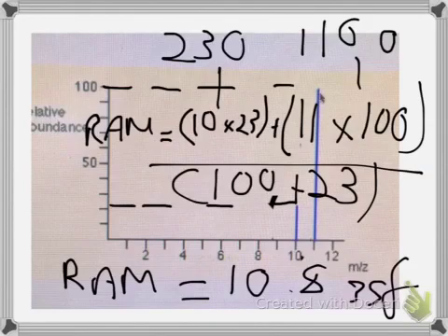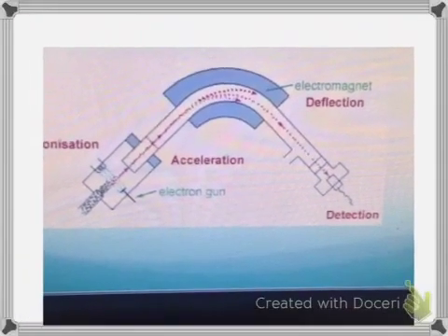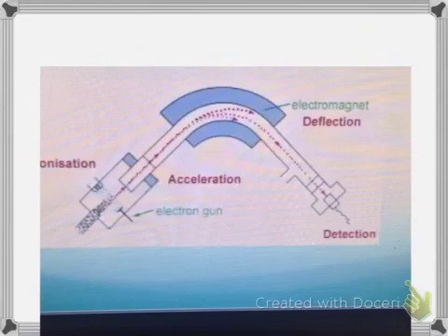And I could do that exactly the same for any molecule. Obviously, for diatomic molecules, I'm going to end up with a more complicated fragmentation pattern. Then we can look at my accelerator and my mass spec again, and see how this is going to be used to help in the detection of steroids in athletes, and how it's used by pharmaceutical companies in identifying drug precursors.